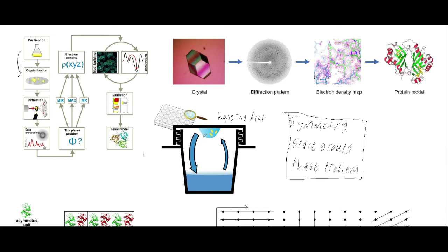What happens is the solution up here is evaporating and then condensing into the solution down here faster than this is going back into the drop.